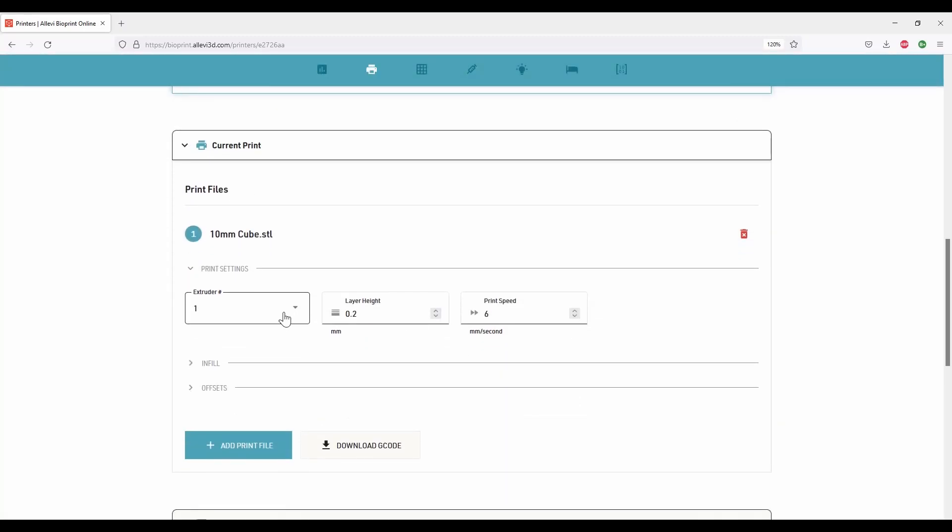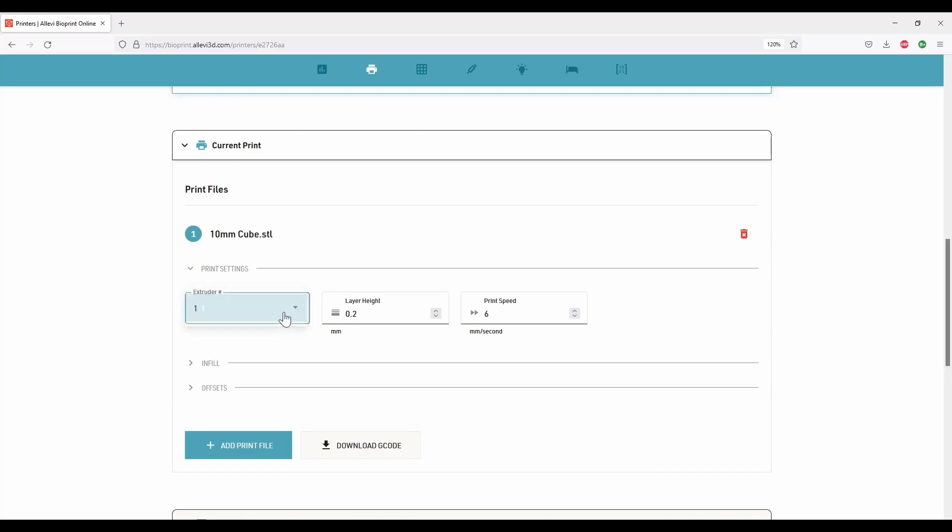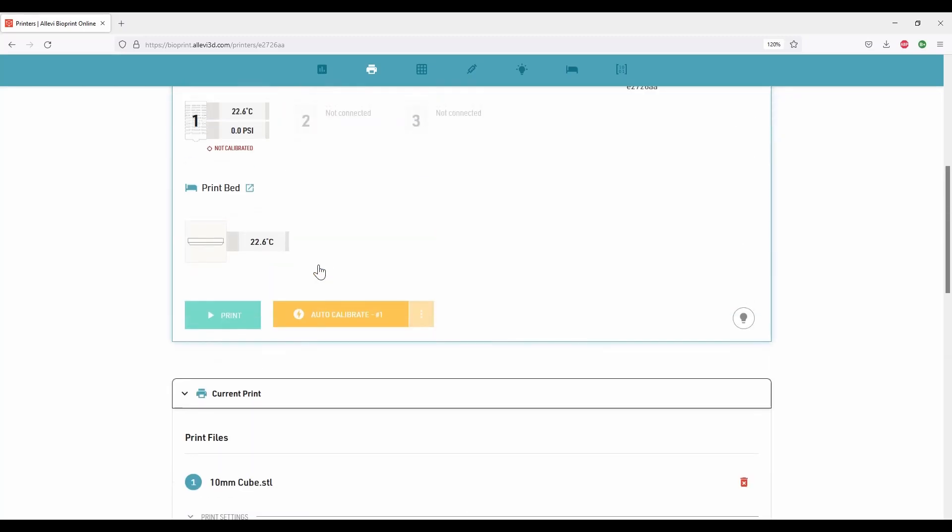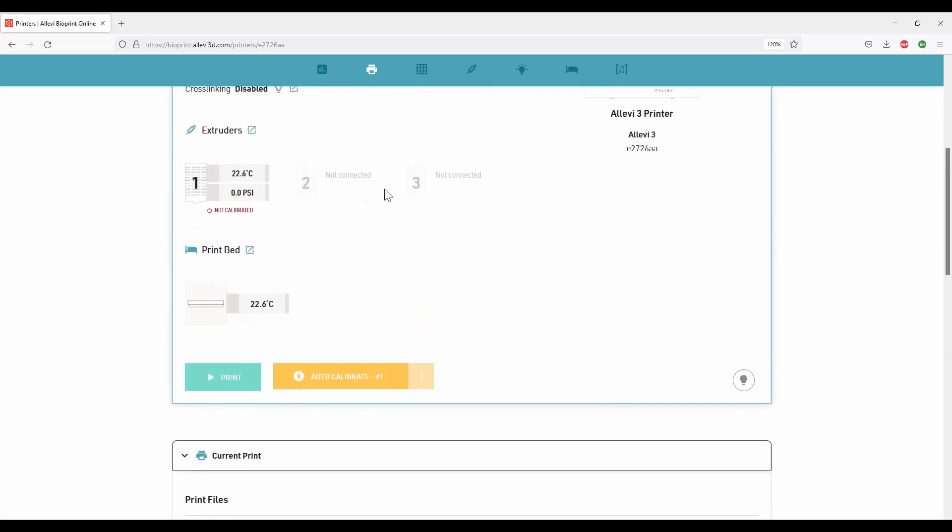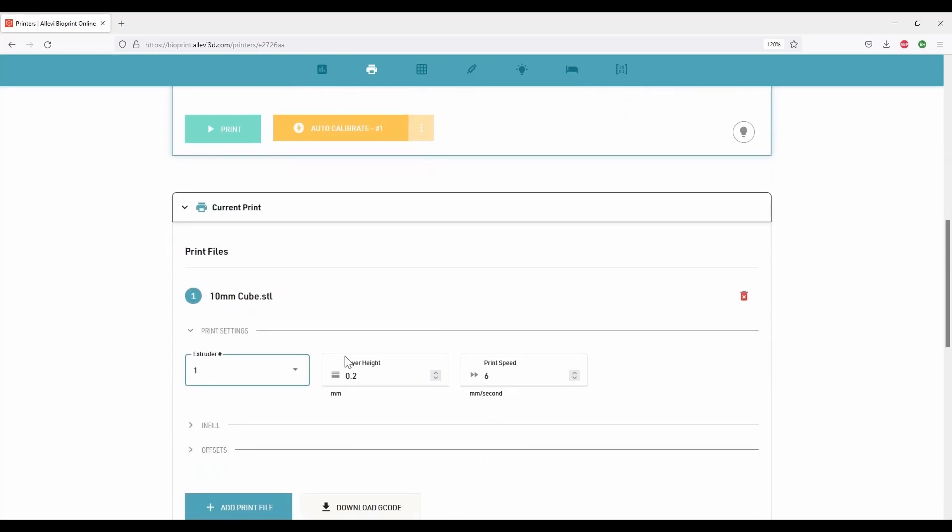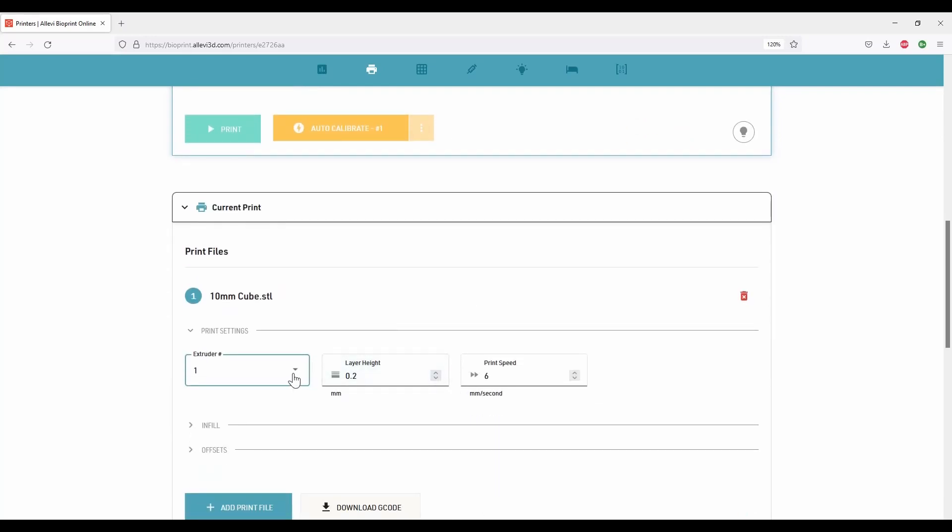Here we can choose the extruder for printing the selected model from the drop-down menu. As we have only one extruder installed, it is selected by default. If we had multiple extruders installed, we can choose a specific extruder for a specific model.